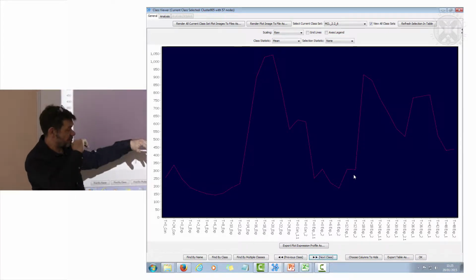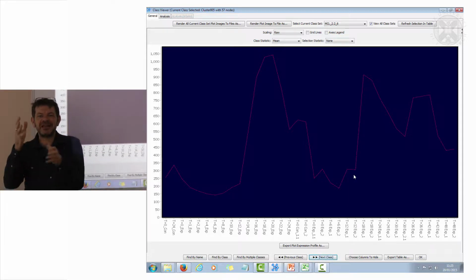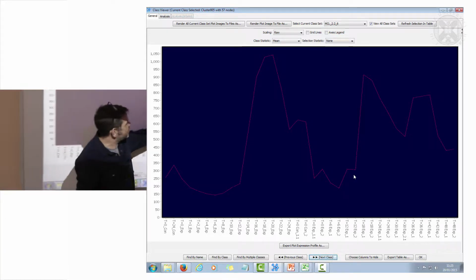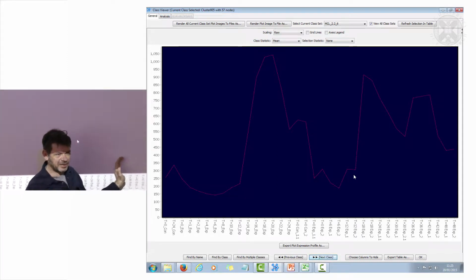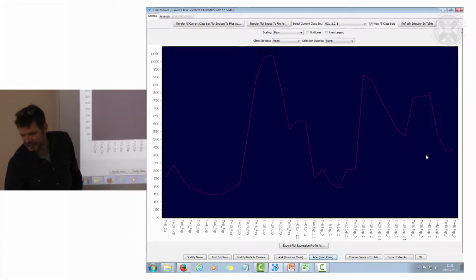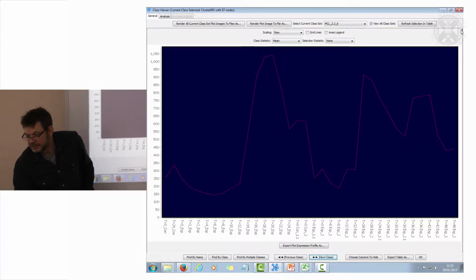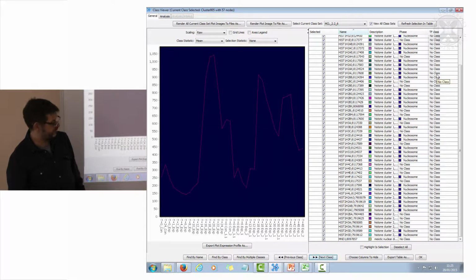What tends to happen with fibroblasts is that they go into the cycle and then it becomes an asynchronous population. This tells us that it's not completely asynchronous and there's a second division going on within this second 24-hour time point. It's only these genes here that show that. And if I reveal the identity of these genes, histones, tons of them.